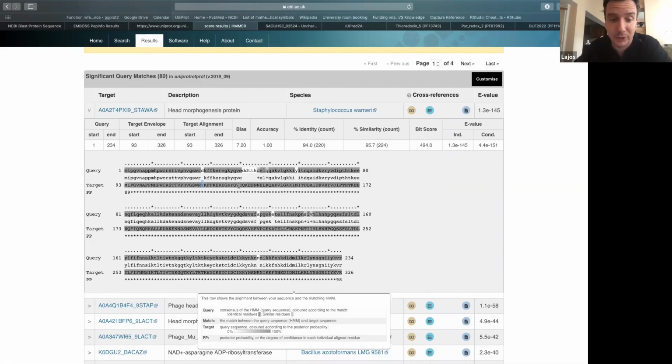And actually, I really like the sequence of this one as well. So this is your query. Yeah. So it's extremely hydrophilic, also negatively charged. If you see a concentration of negative charge in one place, that's always very interesting. E, D, D, E here as well. These are all negatively charged residues. I don't know if you can color it here.